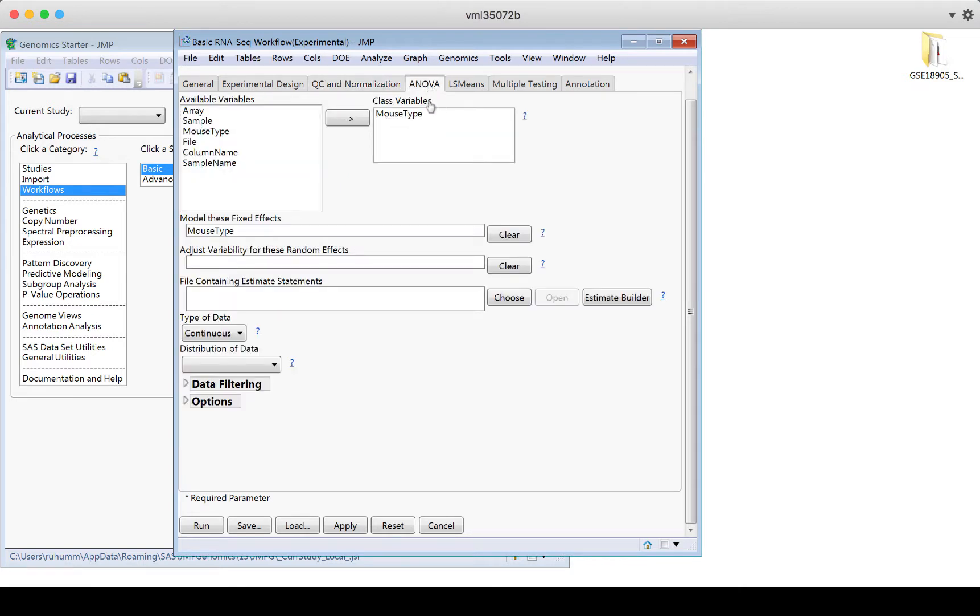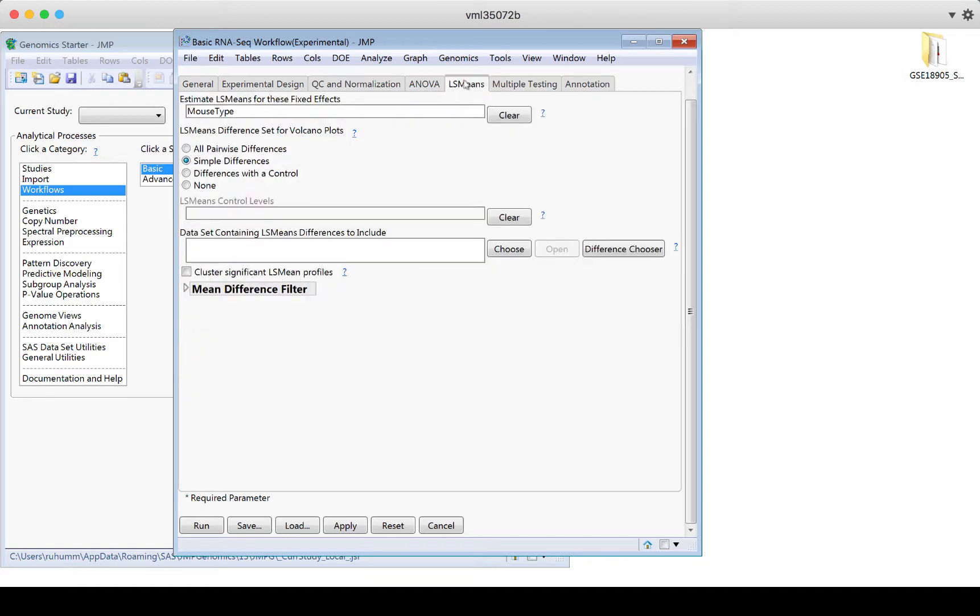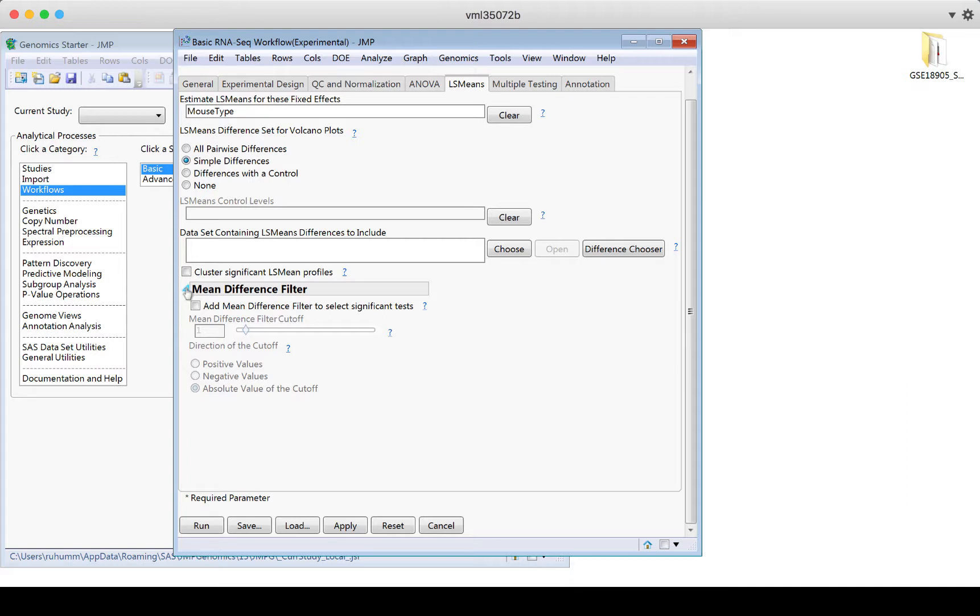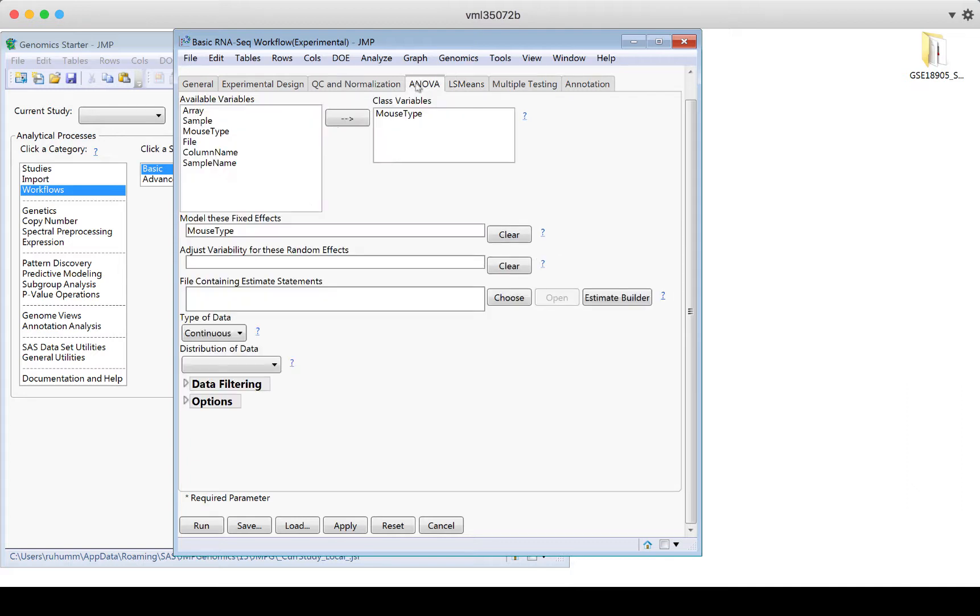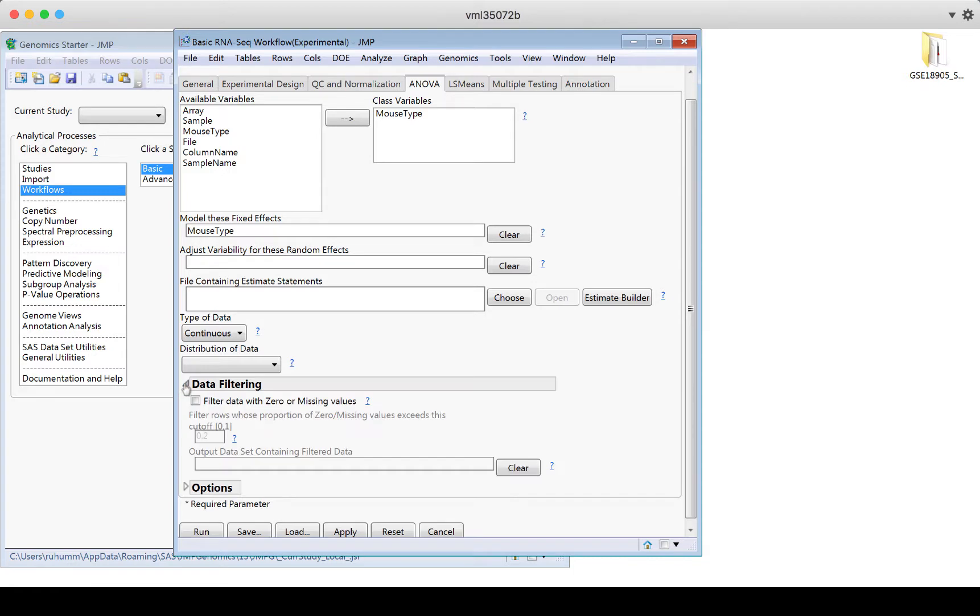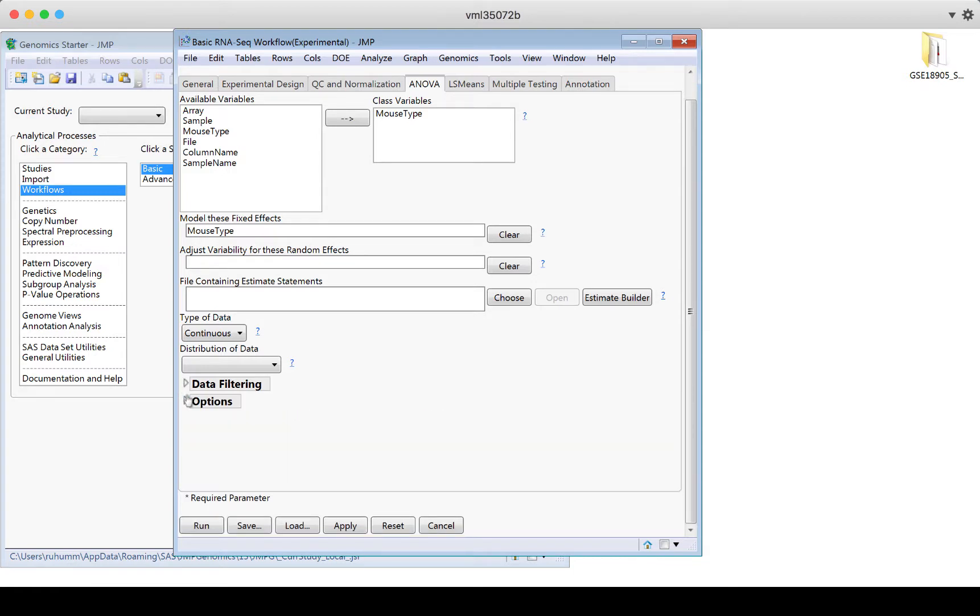Then I'll go to ANOVA. I see that I have one class variable. That's a categorical variable. So this is groups. So mouse type is the type of mouse. I'm going to use that as a fixed effect in the model. I'm not looking at any other random effects. I can always expand these buttons if I want to look for more options. These disclosure buttons are expandable. That was true on this tab as well. I could look at data filtering here. I can look at options.